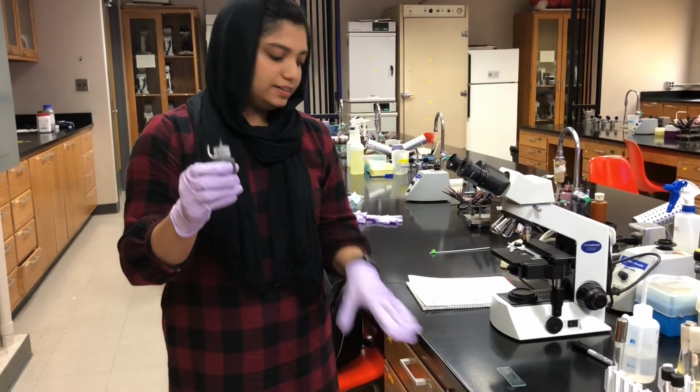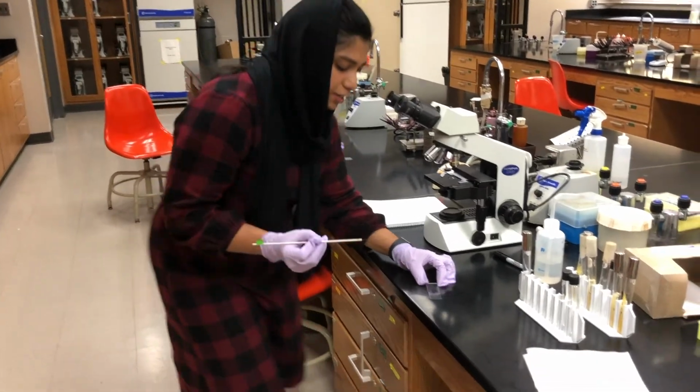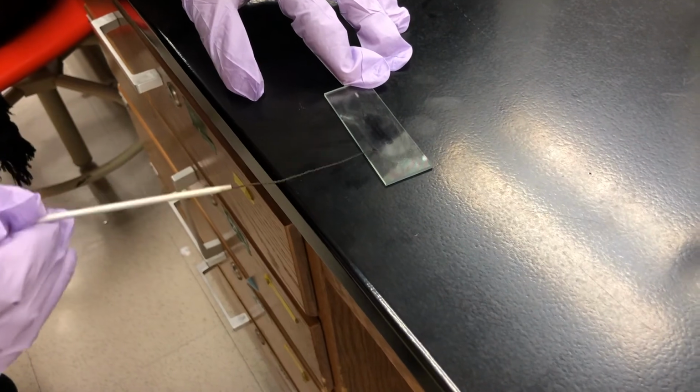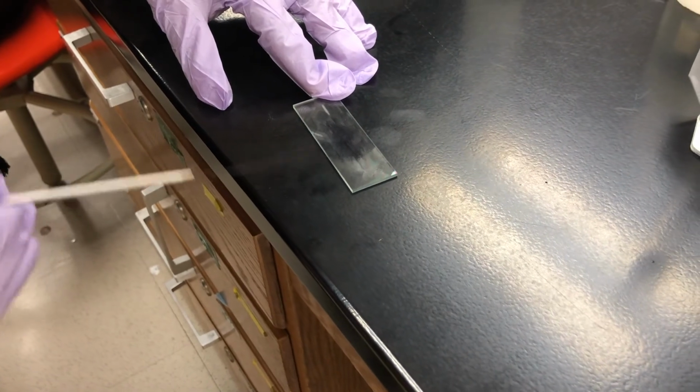Now we're going to add 1 drop of nigrosin dye onto the slide. After adding the dye, I'm going to spread it very nicely onto the glass slide to make it very thin so that we could see those cells easily and clearly.